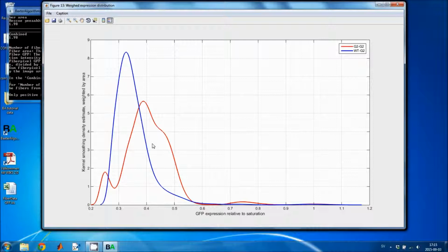and the results won't be skewed by a small piece of tissue with very small fibers.